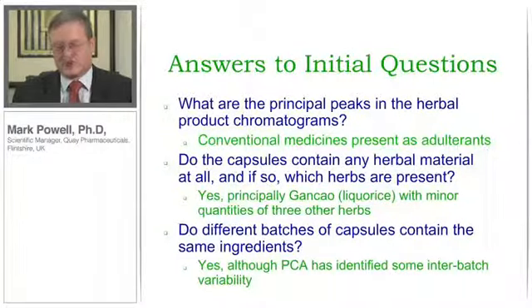And the other question that we asked was, are the capsule batches manufactured consistently? And I think we've seen from the data in the principal component analysis that there is a reasonably good consistency between the capsule batches, although there are some minor variations.